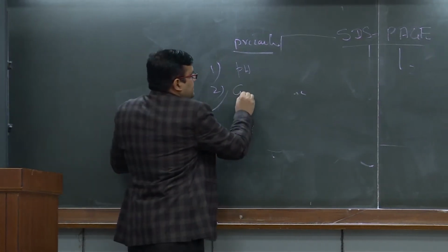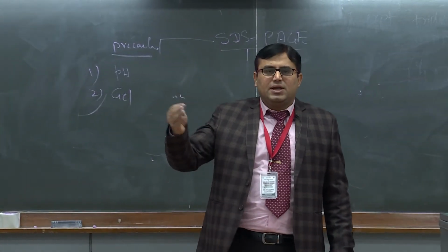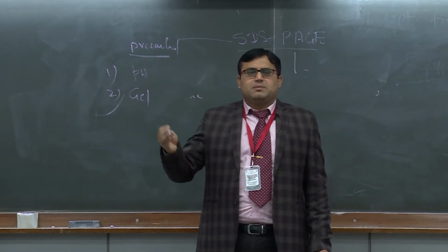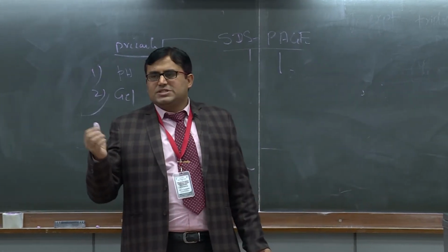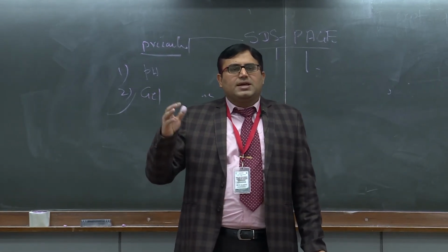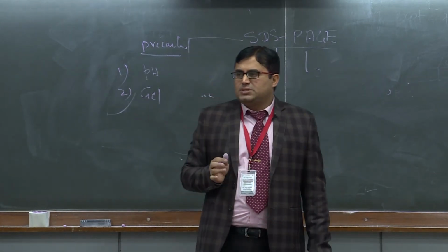Second is the gel, the resolving and the stacking gel. The chemicals which you are going to use should be high quality biochemical grade chemicals, right? Because a lot of contaminant-based chemicals are available. In most labs I have seen, if you use below standard chemicals, your run and protocol are perfect, but they complain that the result clarity is not there, right? You have to use standard chemicals.